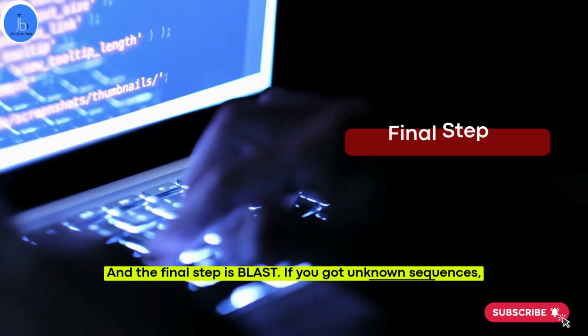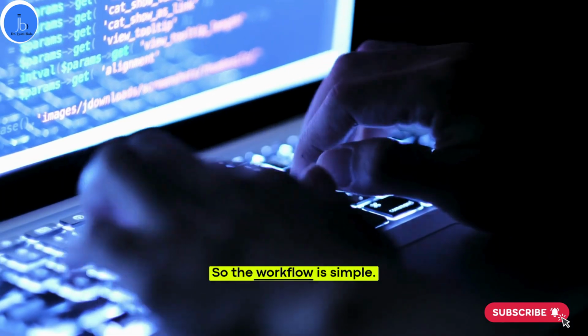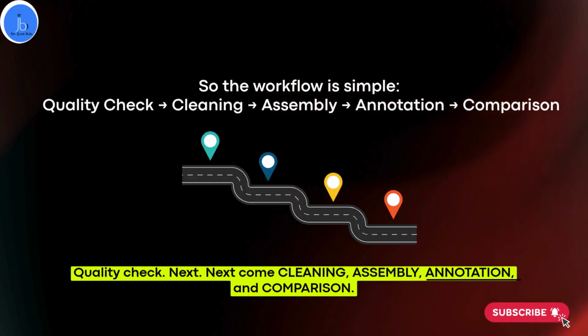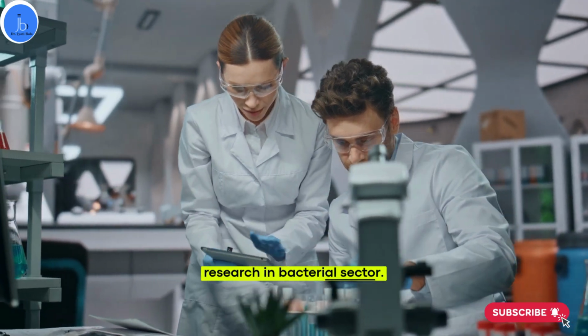If you have unknown sequences, BLAST compares them with the global databases to find the matches instantly. So the workflow is simple. Quality check, next comes cleaning, assembly, annotation, and comparison. Master these tools and you're ready for real-world bioinformatics research in the bacterial sector.